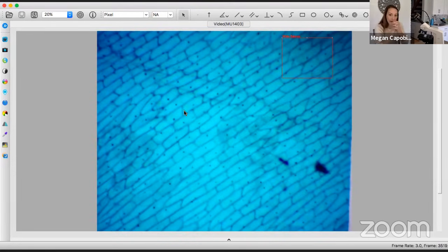So what we are looking at here is plant cells. Now, these are pretty interesting. I always think that they look a bit like bricks that are laid down. They're right next to each other, and they do have a pretty strong structure. Now, why do they have this shape to them, do you think? What kind of organelle or extra structure do they have that animal cells would not have? They're going to have a cell wall. Let's take a closer look at these.